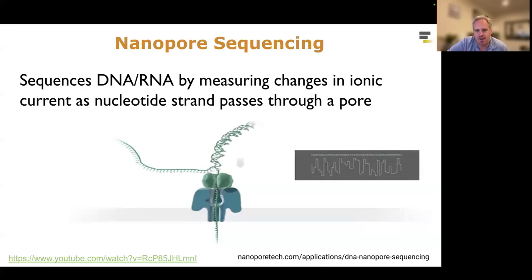Today, with modern base callers using recurrent neural networks or transformers, the modal accuracy is something like 99% or better. Although you do get a bit of a tail where some of the reads will only be 98% or 97%, down to 95%, you can often detect when reads have lower accuracy. You'll get a quality value measurement. It's very common to filter out very low accuracy reads from your de novo assembly, and to preferentially prefer reads that are higher accuracy and reads that are longer. If you can collect reads that are 100 kb and more than 99% accurate, that's outstanding data for de novo assembly. You're going to get a really high quality assembly out using such data.